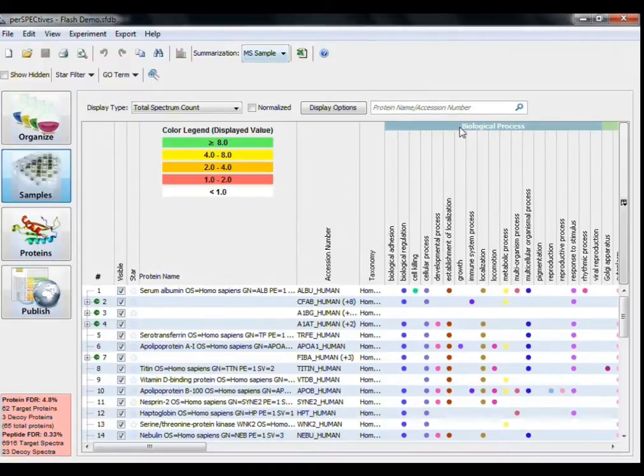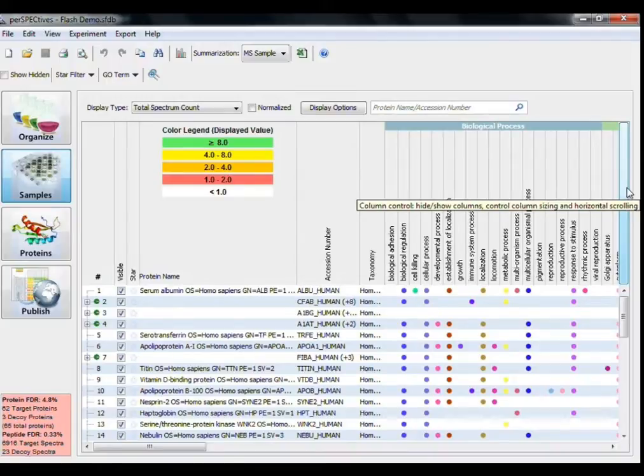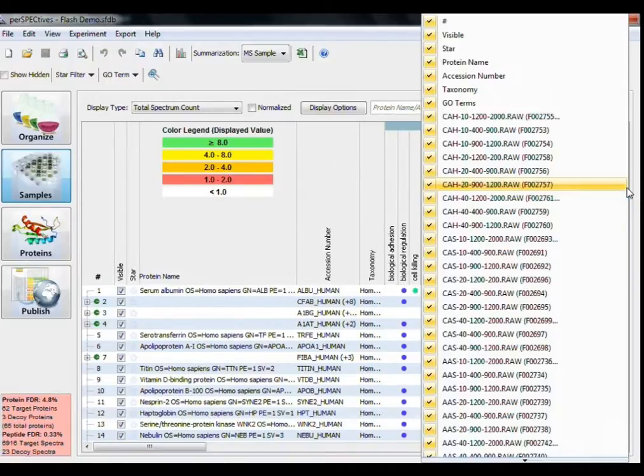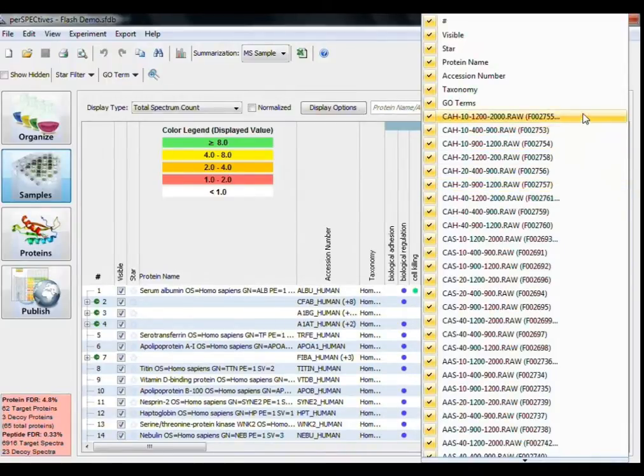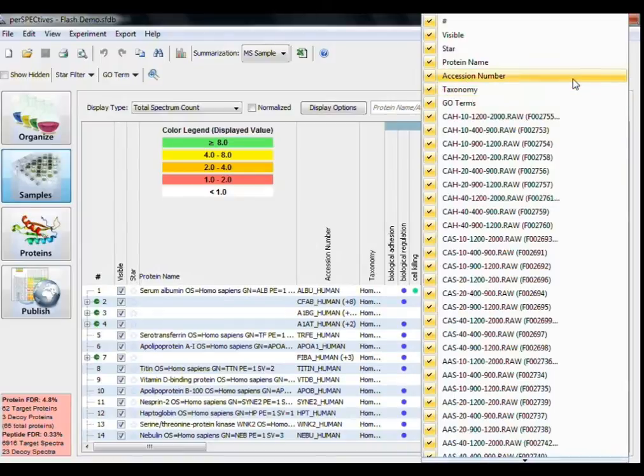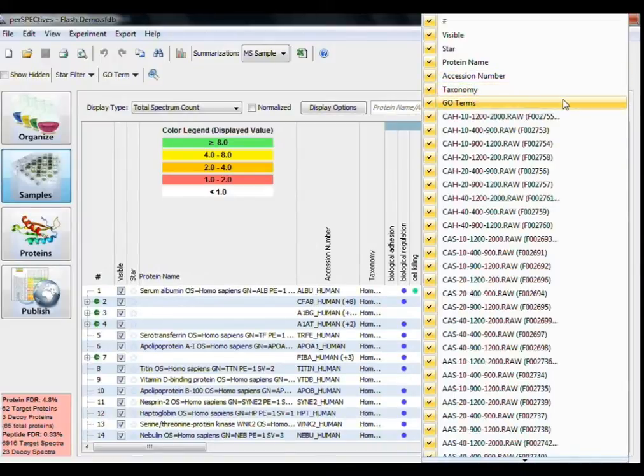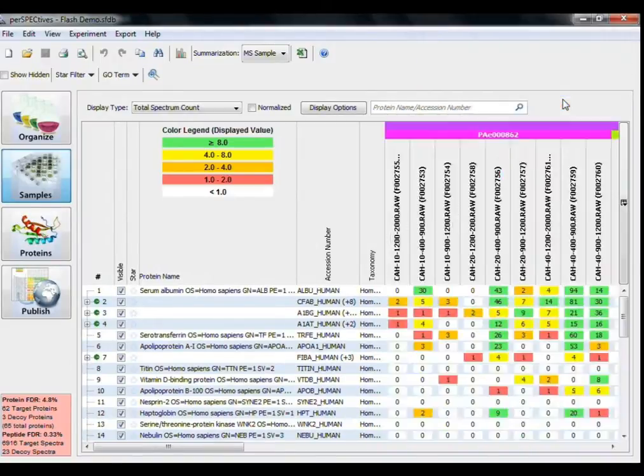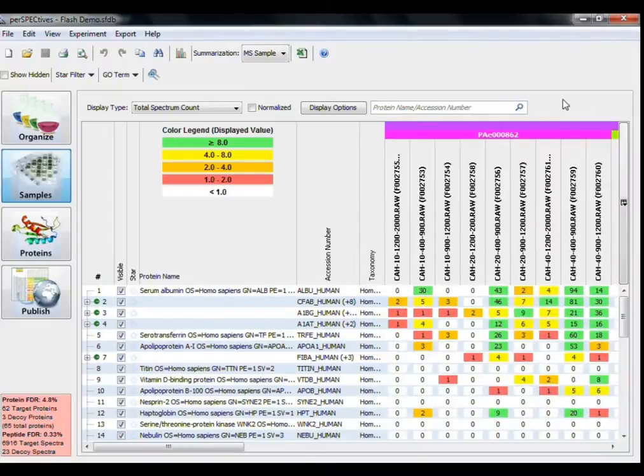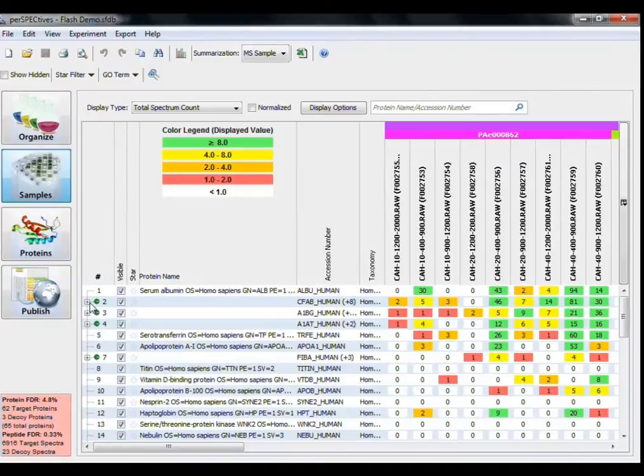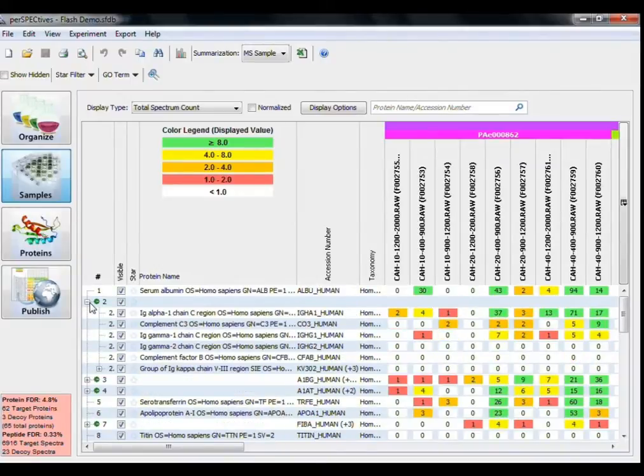I want to hide the GoTerms for now, so I'm going to click on the Column control, which is the drop-down menu to the right of the column header. This is a list of each of the displayed columns. Clicking on the GoTerms menu option will uncheck and hide all GoTerms in the table. Note that the proteins will retain their clustering by GoTerms even when the annotations themselves are hidden.